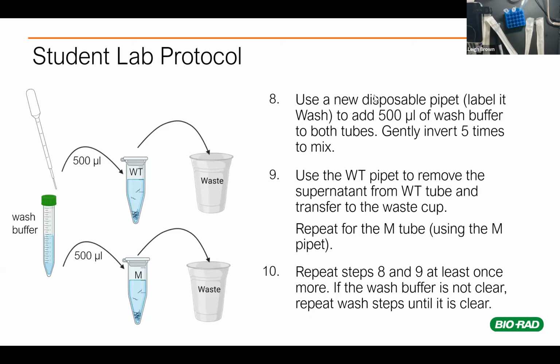But to Mary's point there, if they've got a group that accidentally, because remember, some students with transfer pipettes, weird things happen. If they accidentally suck up all of the worms and then go and put them in the waste, if you were just to give your students an additional set of 2 mil tubes for each station, they could then put waste from one worm type into each one of those tubes. So if something did come up, they would still have their worms in there.